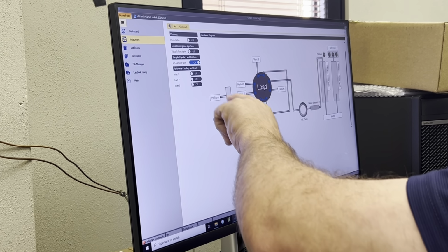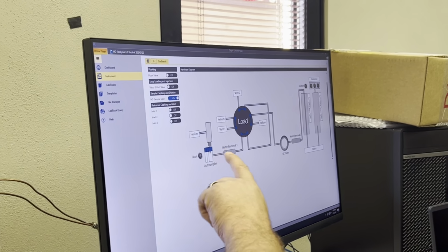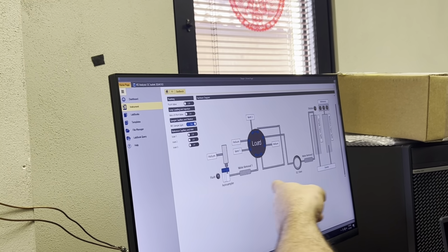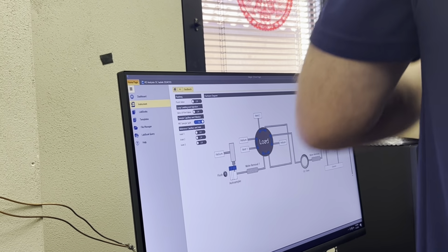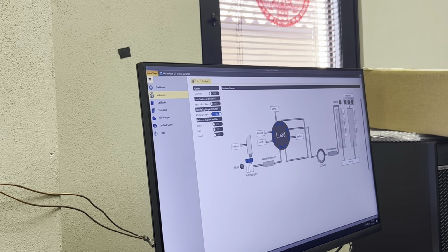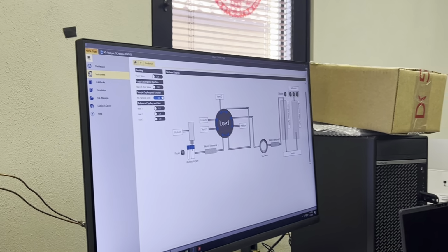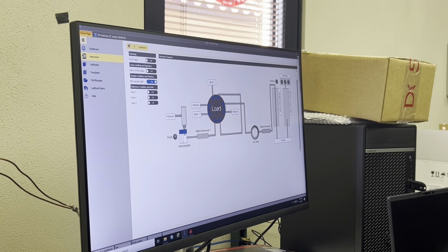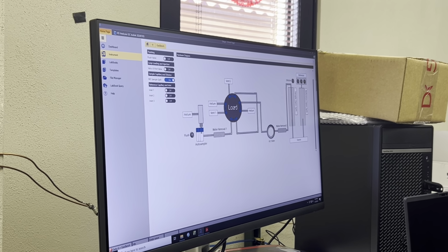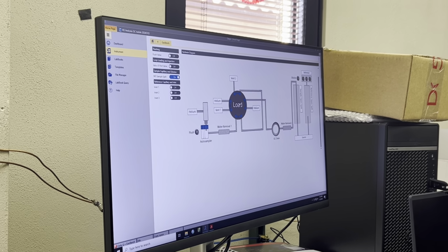So the flush bit is completely different to this, because the flush does not come here. It's cut. If you use the flush needle, it just goes to atmosphere. So you're just flushing the tube out. The helium goes to the sample vial and goes out to atmosphere. Whereas in this case, the sample actually goes into that line.